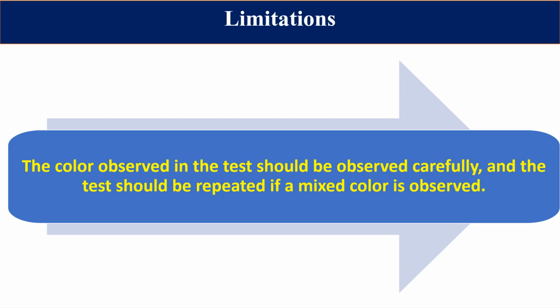This is all about the Isatin test for proline and hydroxyproline. Slowly we are going to cover all the qualitative and quantitative tests for all the amino acids and other biomolecules.